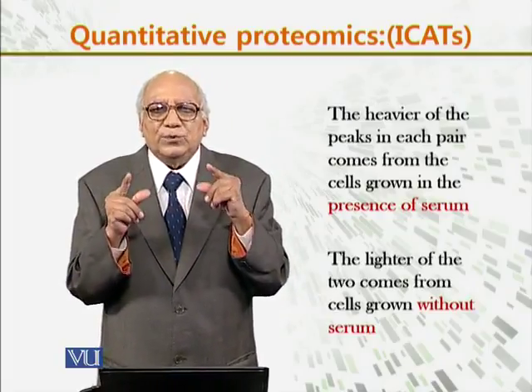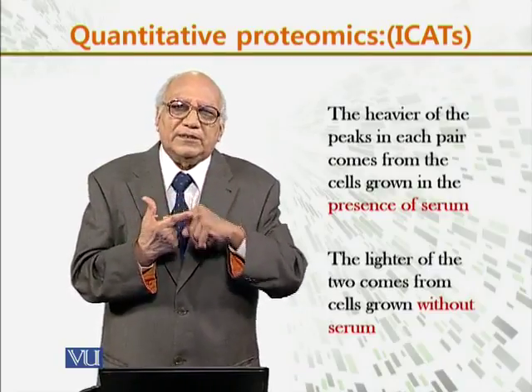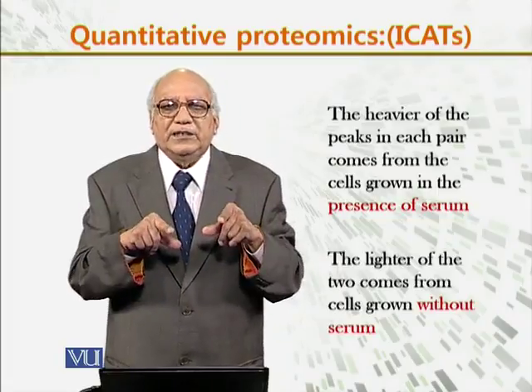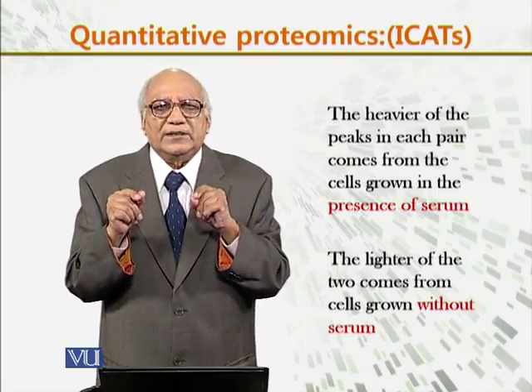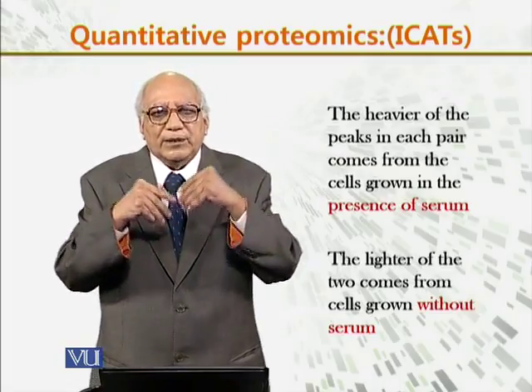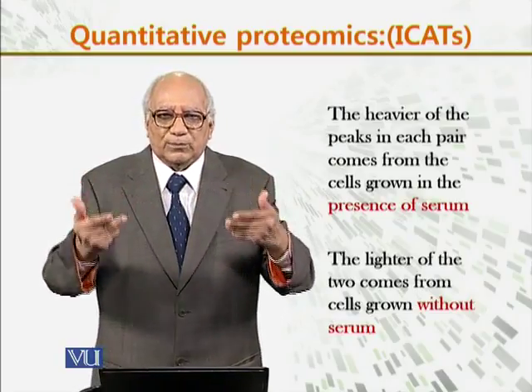That is, in the two conditions, the cells grown in the presence of serum and the cells grown in the absence of serum, we get the heavier peaks in the LCMS with the presence of serum, because the serum provides more energy and more proteins.